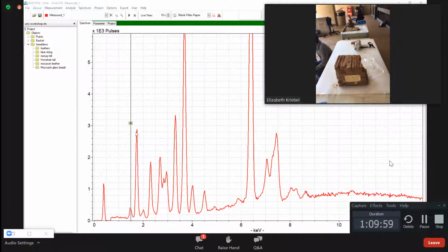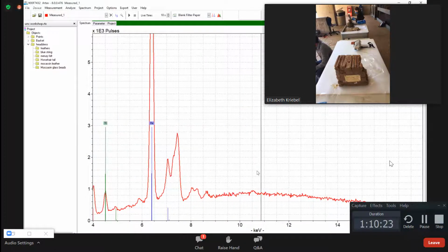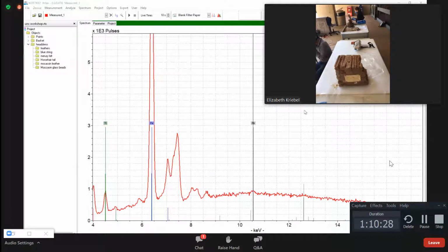So we got some dirt, aluminum, a lot of silicon actually. Sulfur once again. Interesting. Potassium, calcium, some titanium, and a lot of iron. I'm guessing it's bleed over from a pigment somewhere in this guy. And no evidence for any lead. I can maybe see a very trace of lead, but nothing to write home about. Nothing more than a couple ppms.